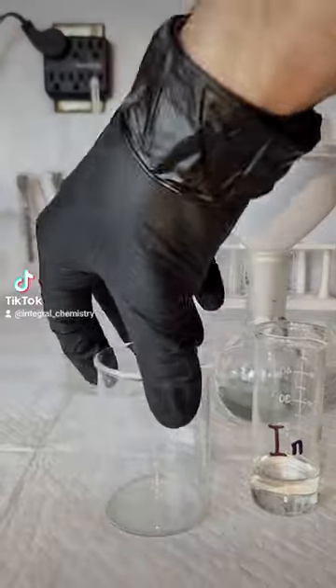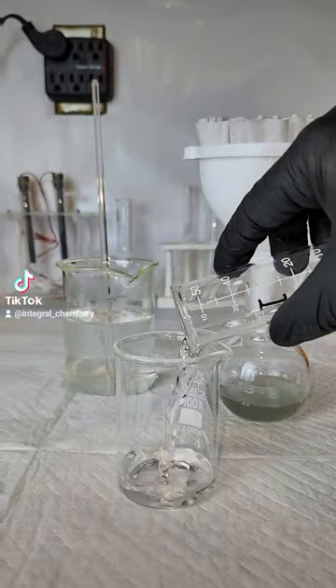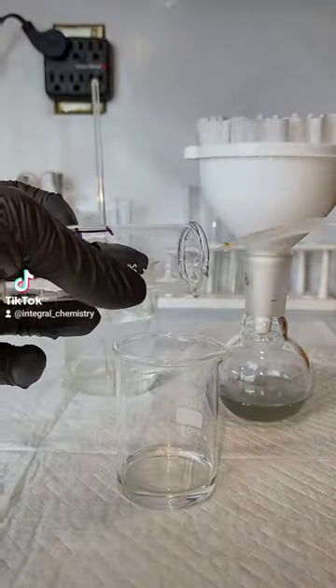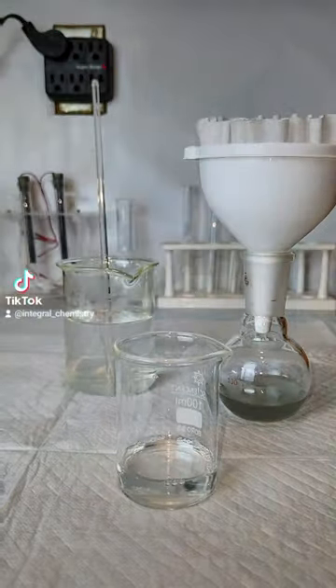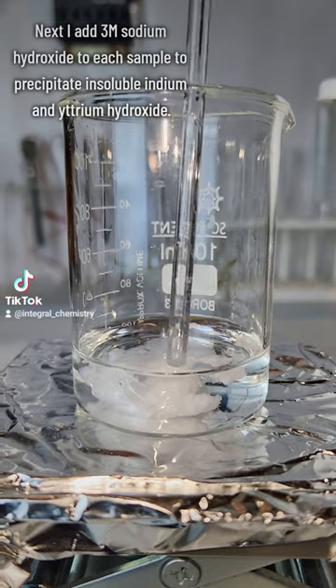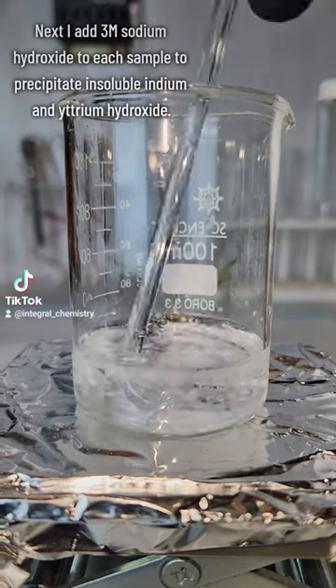The next step is to make yttrium hydroxide and indium hydroxide, which are both completely insoluble. To make these insoluble hydroxide salts, I add a 3 molar sodium hydroxide solution very slowly to each sample until I reach a pH of 9.